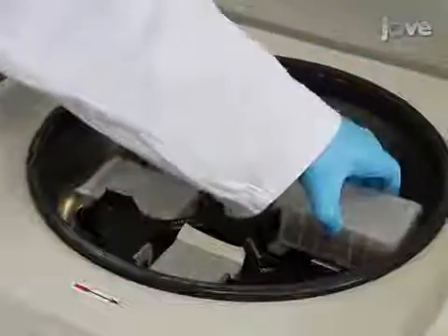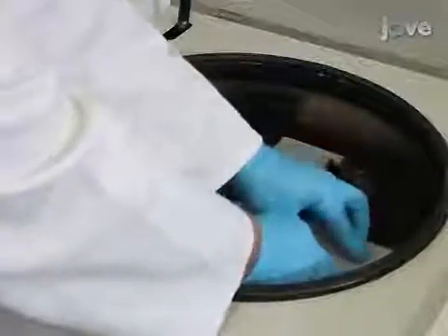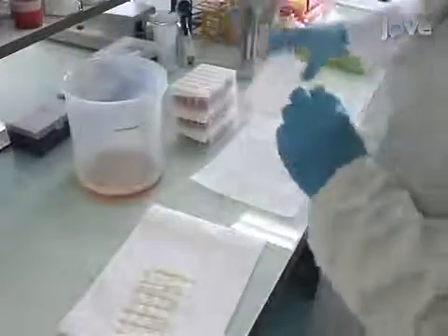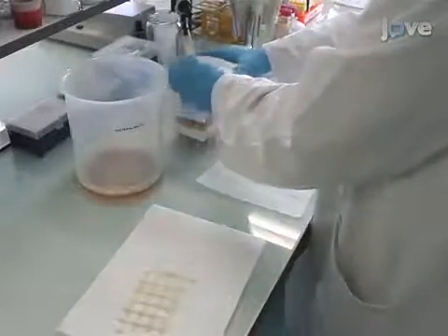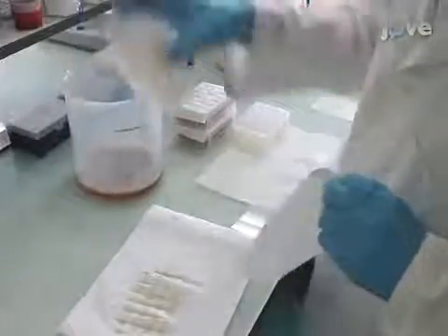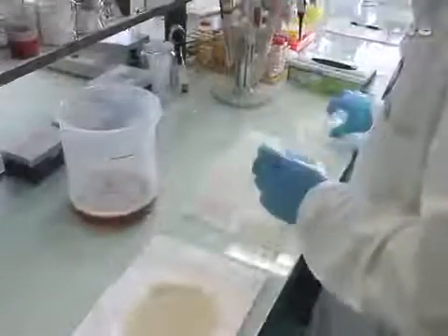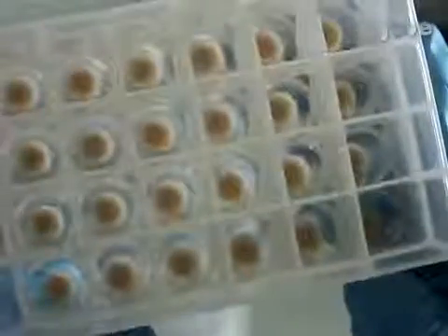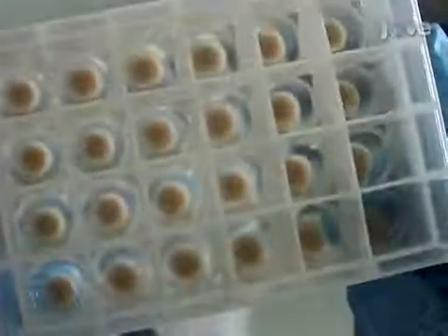The following morning, centrifuge the deep well 24 plates for 10 minutes at 3000 Gs. Discard the supernatant into a waste container containing an antimicrobial agent, and then tap the plates upside down onto absorbent paper to remove any residual medium. To verify that the cultures have grown correctly, check for the presence of pellets in the deep well.